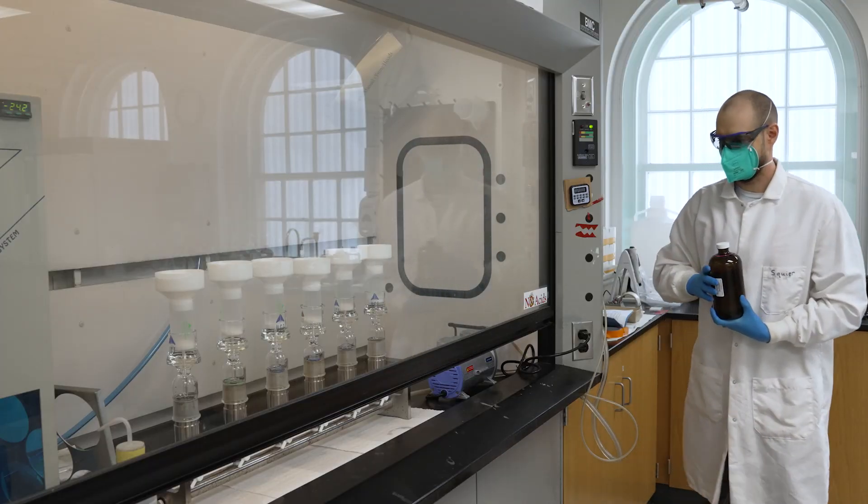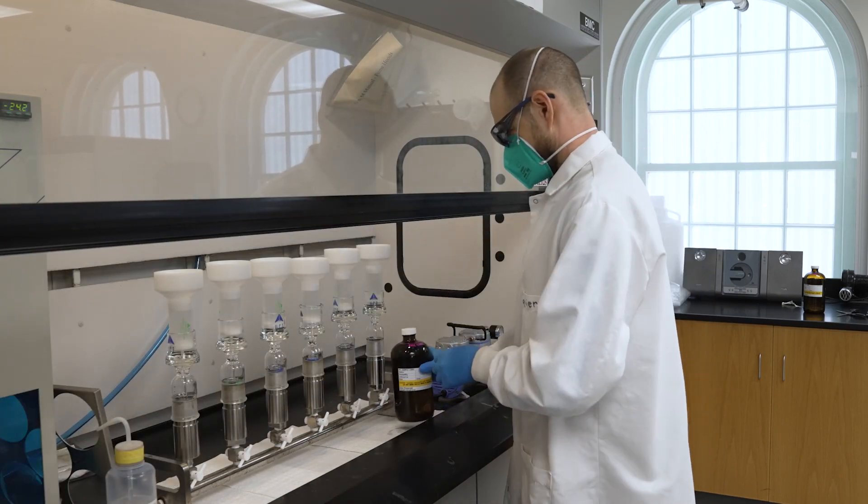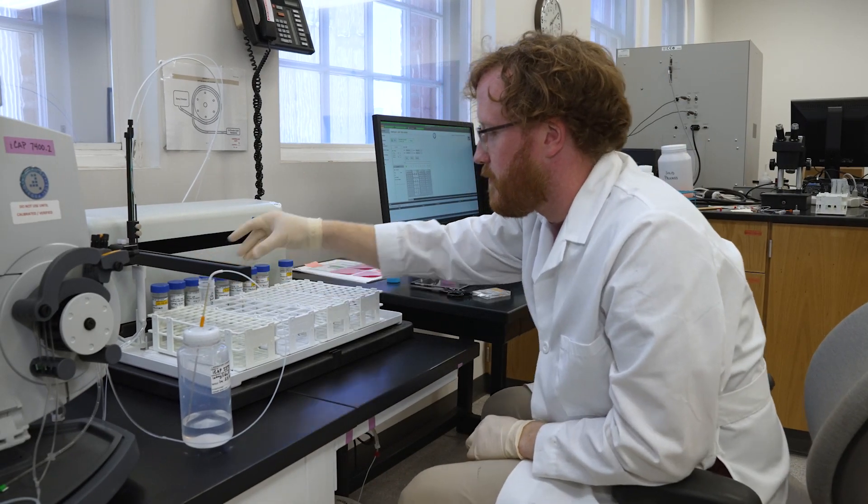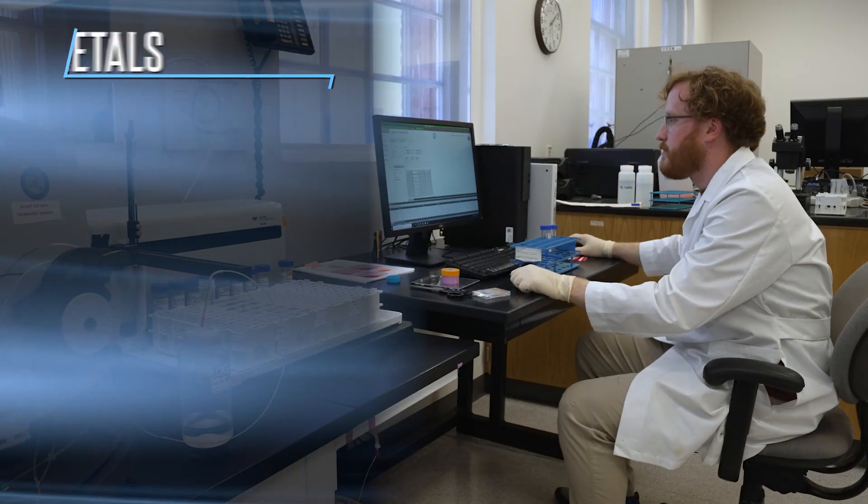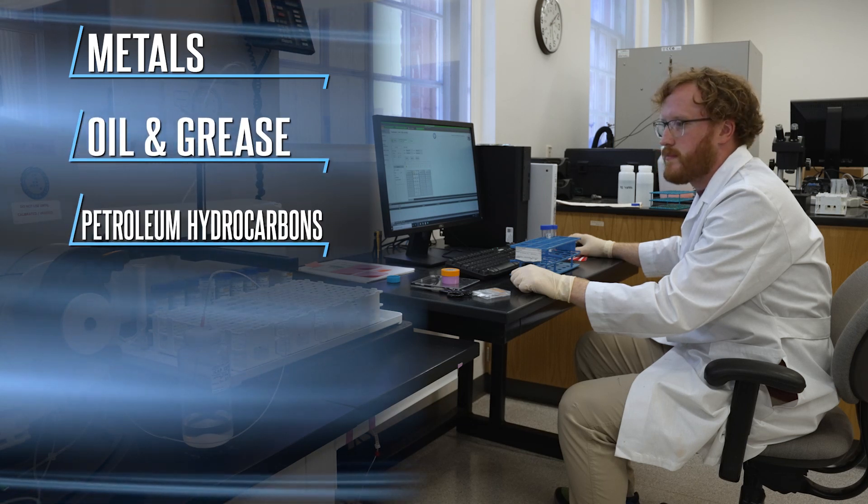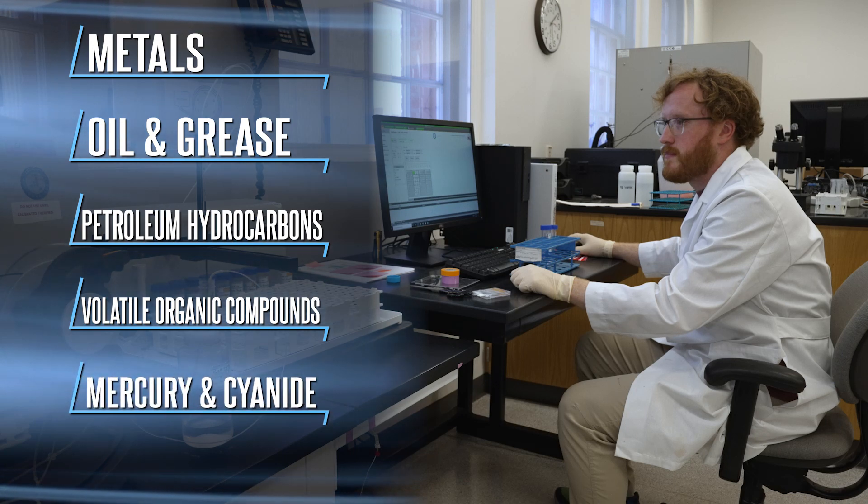The Analytical Chemistry Branch supports environmental and some non-environmental testing in the shipyard. Code 134.1 conducts Clean Water Act analyses, testing water from metals, oil and grease, petroleum hydrocarbons, volatile organic compounds, mercury and cyanide.